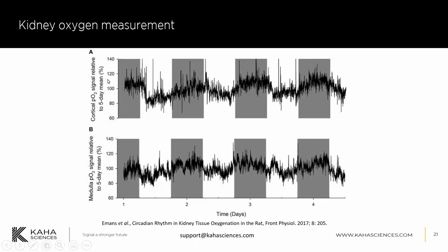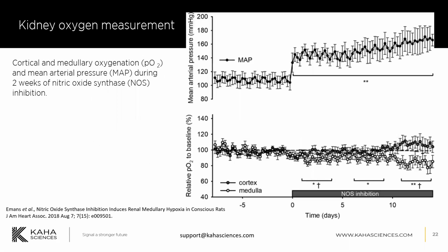But this just highlights one of the key advantages of using telemetry in that you can capture these variations across the day rather than having a single time point measurement if you had to do it manually in acute experiments.